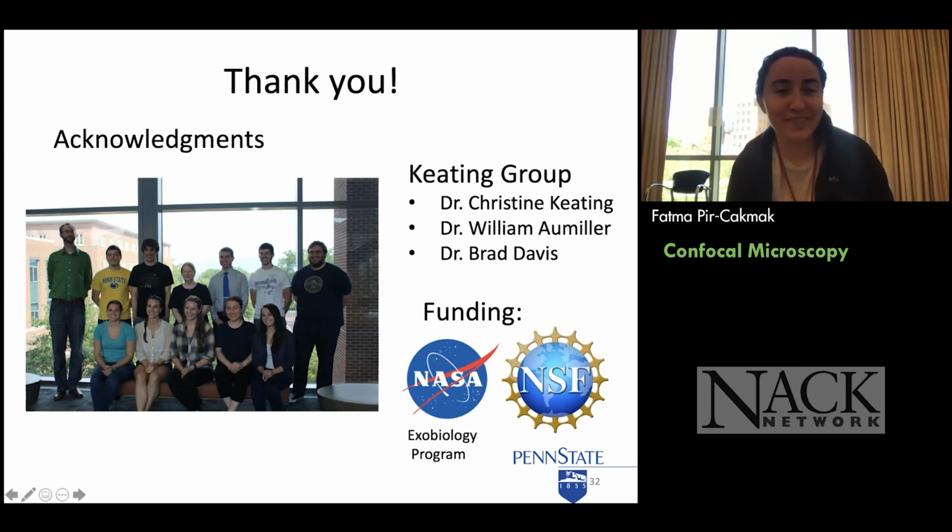Thank you. Fatma, this is Peter. I've got a question about just doing the base microscopy on the droplets. Do you need to use a fixative in order to prevent the droplets from moving around, or do the droplets on their own just stay in place when you do the imaging?